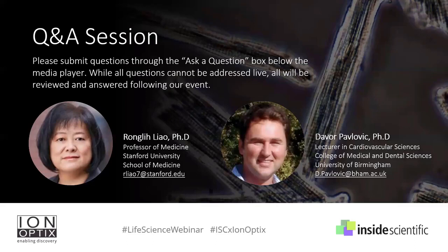In fact, I always try not to mince the heart by scissors if I can. I hope that the heart is digested enough that I can just pull it apart by tweezers and then triturate quite gently, and I tend to introduce BDM into this protocol. So yes, absolutely, I think you can damage the cells by mincing by scissors. So tease it apart with the tweezers, and then triturate fairly gently.